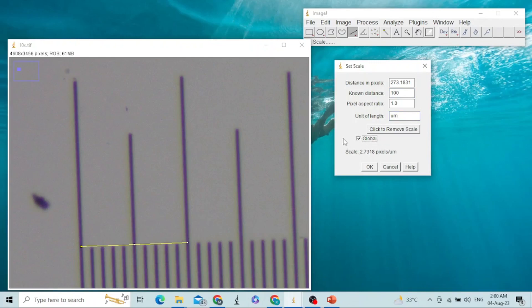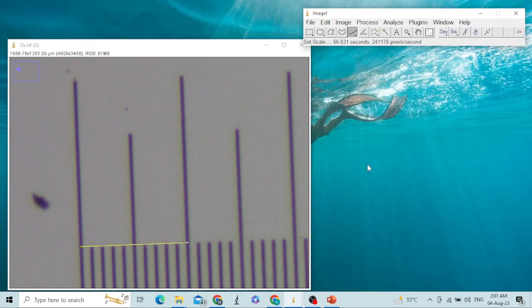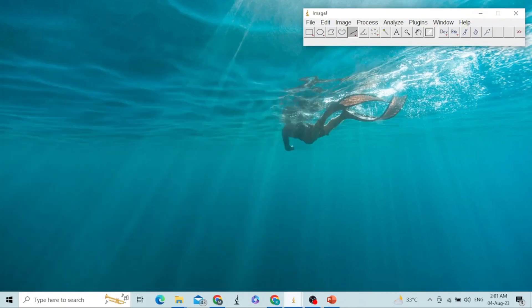By checking the global checkbox, we are ensuring that all images used subsequently will use the same calibration. We will click OK, and with this, our ImageJ has been calibrated. We can now use it to measure the size of different objects.